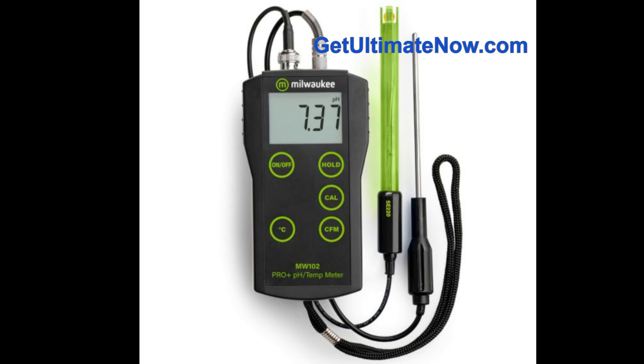Calibration is essential — it's like tuning a musical instrument to make sure it's hitting the right notes. The MW102 Pro Plus has two-point automatic calibration, meaning you use two solutions with known pH values to adjust the meter's readings. It's a simple process but makes a big difference in accuracy. It's not a set-it-and-forget-it situation — as a rule of thumb, calibrate at least once a month.